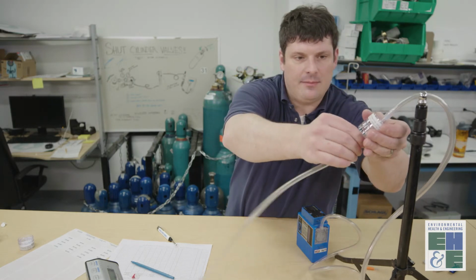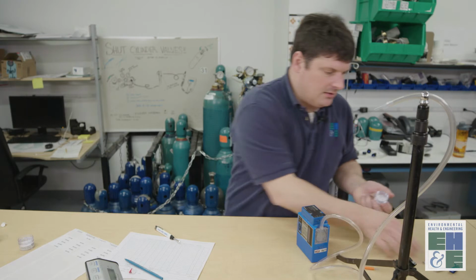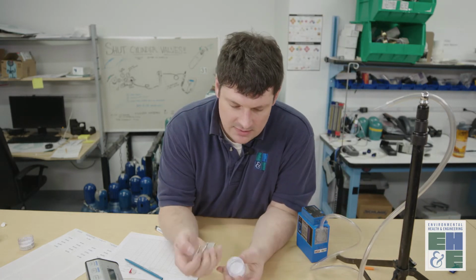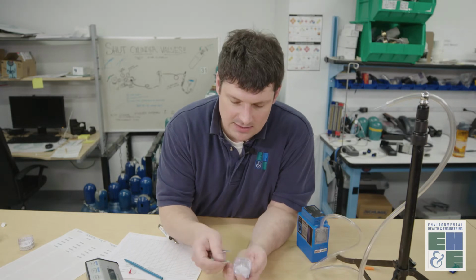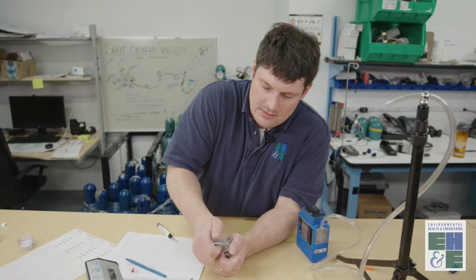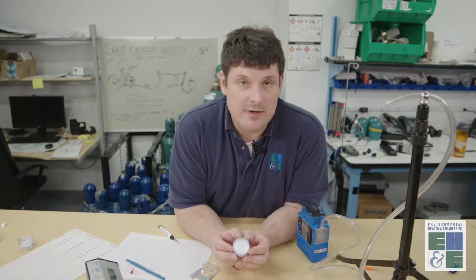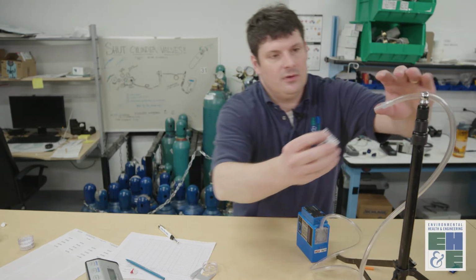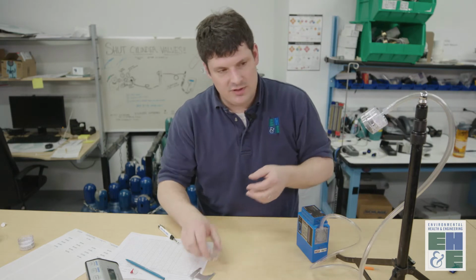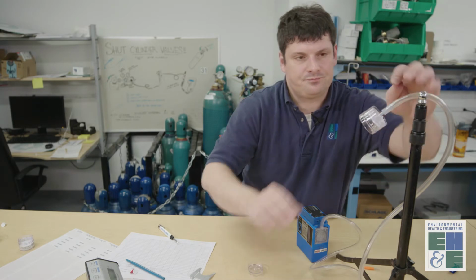But we often sample this type of media open face, which means that we take this top cap off. This is a cassette opener. Sometimes there's a band here that has to be cut, and you can cut it right there. But then you use this to pop the top off of the sample. Now the filter is open, so this is an open-faced sample. We would connect it like that and collect our sample. When we're done, we take our flow rate by putting the cap back on.